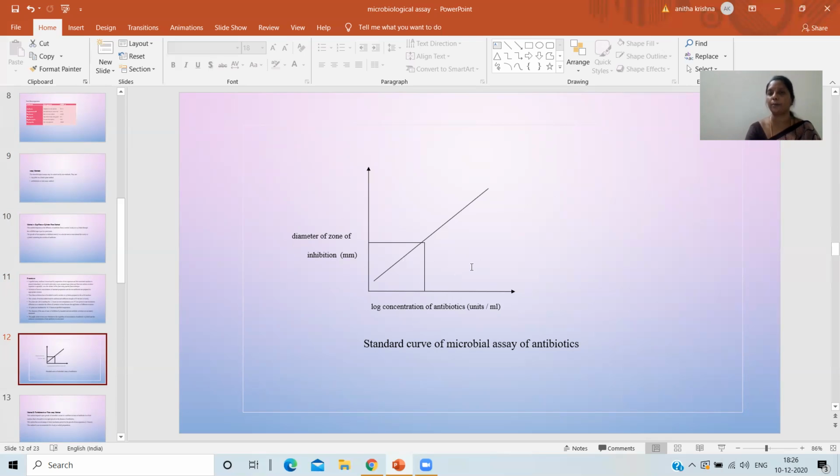So this is how you perform your antibiotic assay. You take the liquid medium, add the test organism, and then pour this medium onto a sterile Petri plate, spreading the organism on the surface. Once it is solidified, you make wells in it, which means digging small holes. Then you take the antibiotic standard and test. Whatever antibiotic you have to test for, you perform the assay on it, and the standard antibiotic is also taken, and appropriate solutions are made to known concentrations.